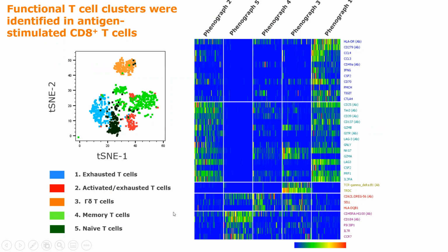Now for our data analysis, we loaded our mRNA and Ab-Seq expression data table into BD proprietary analysis software, SeqGeq. After generating a t-SNE cluster, we identify CD8 positive T cells using Ab-Seq markers and perform an unsupervised PhenoGraph analysis to further identify subclusters within the CD8 population. 5 subclusters were identified based on their gene and surface protein signatures, giving us the functional status from naive, activated to exhausted.